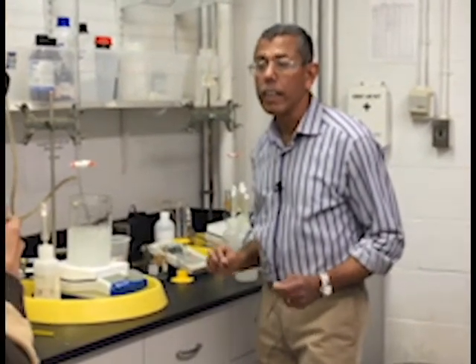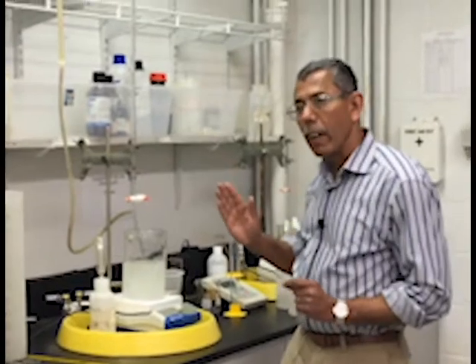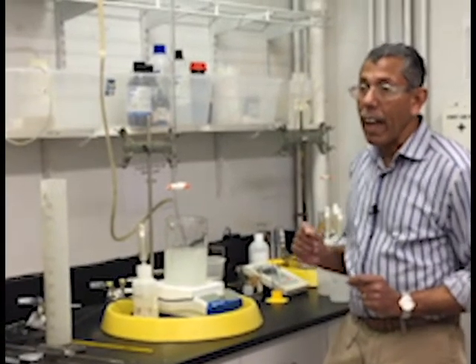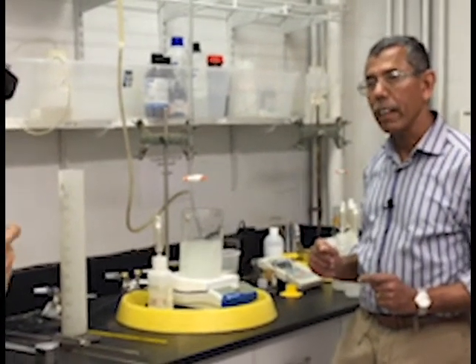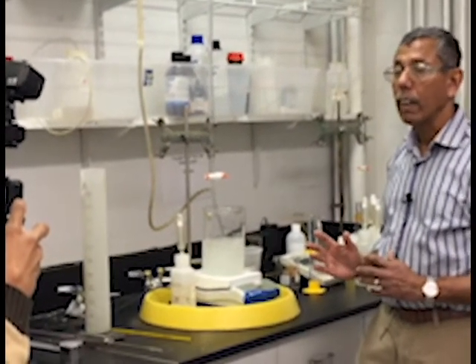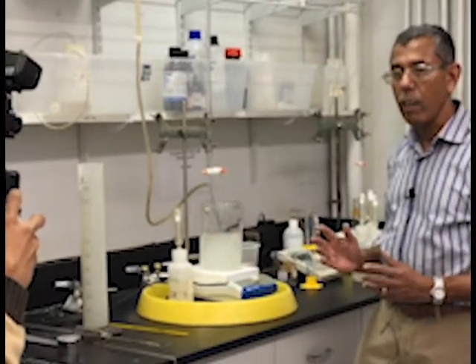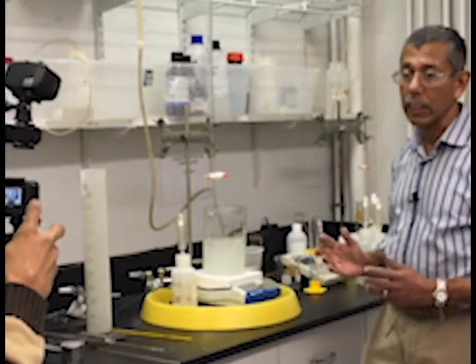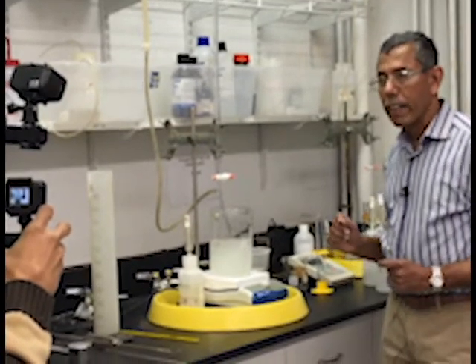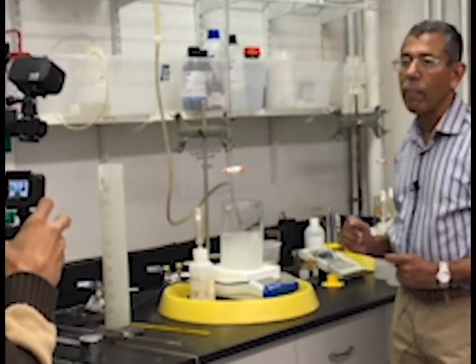At this point I am done with the titration, but before I can complete my calculations, I really need to do the titration one more time. The difference this time is we will do exactly the same thing as before, but we will not add any pulp — that is called the blank. We do that to calibrate all the chemicals and make sure all the concentrations are correct. If the concentrations are off by a little bit, doing the blank self-corrects that.